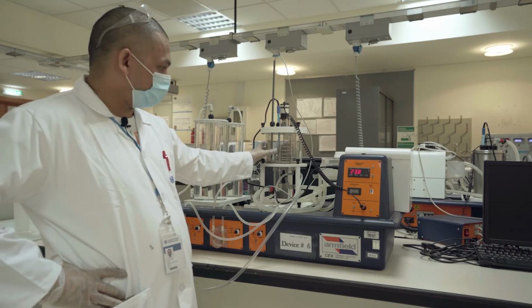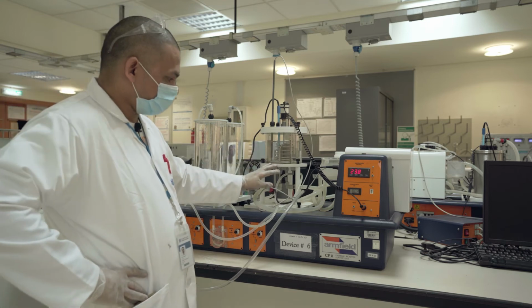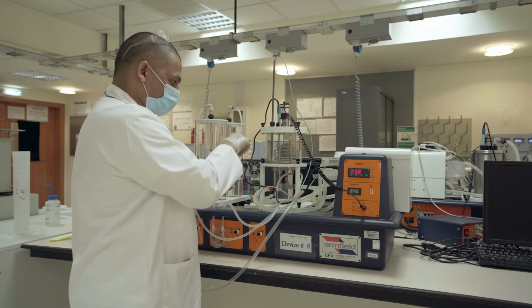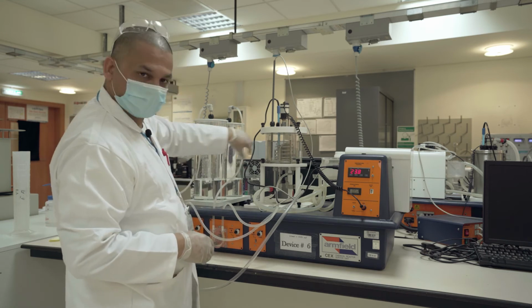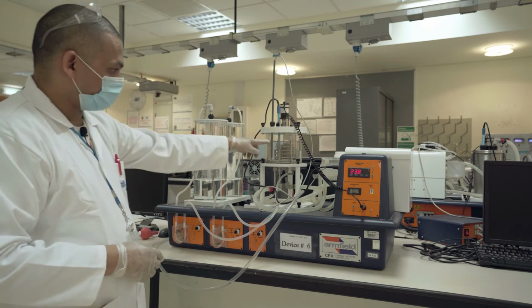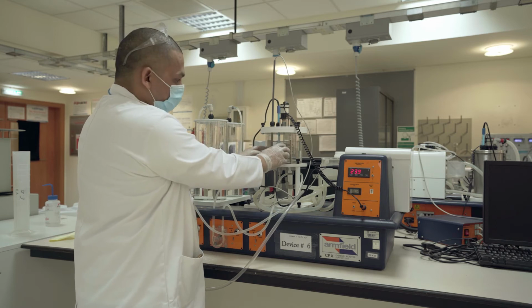This equipment is the CSTR, as we have already seen the batch and the plug flow reactor, the laminar reactor. Here is our reactor. Again, this is a base unit on which you can put this as an add-on for the CSTR, for the batch reactor, for the PFR, or anything. So again we have two different feed tanks and two pumps, same as before. Pump A will take the fluid here, pump B this one. We can see both are coming here and then going into my reactor. So this is the entire reactor.